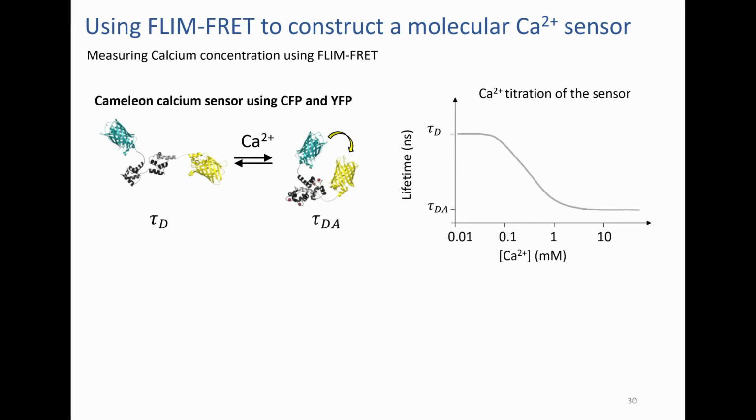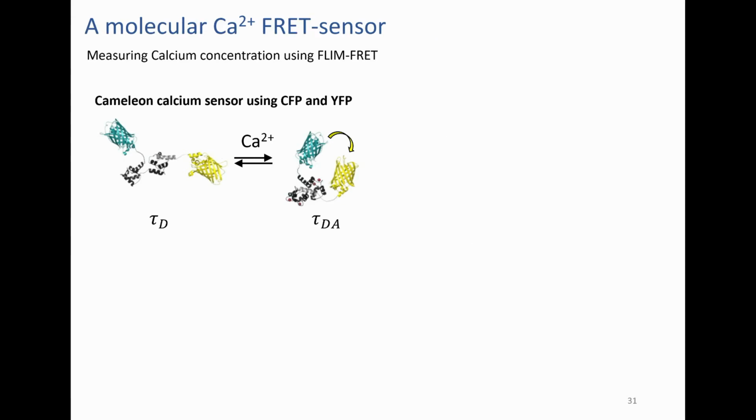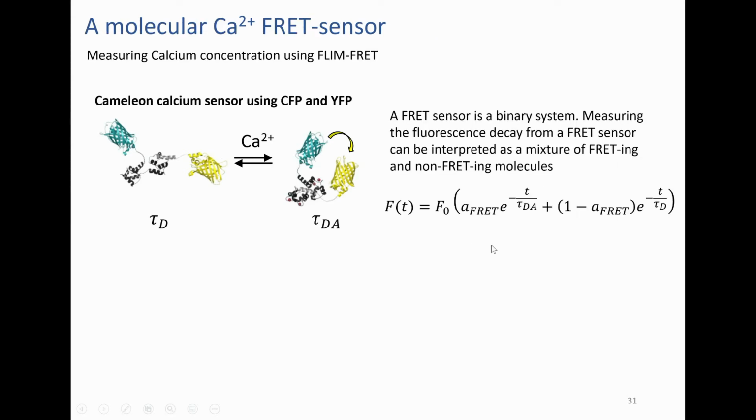And what that allows you to do is, so you see that as you change calcium concentration, the donor lifetime goes down, indicating more and more FRET, because the hinge is locking together. And so we can use this, in fact, to measure KDs, or so-called dissociation constants. So we can actually measure binding strengths. Essentially this is an equilibrium constant, the ratio of the concentration of the unbound species compared to the bound states, right?